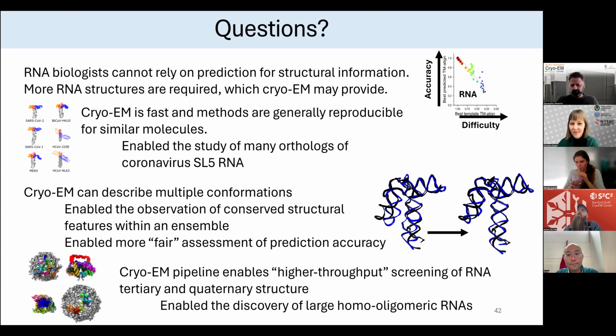Okay. The next question is, at what resolution would you consider a structure as, quote, solved? For instance, for the viral RNAs at 4.5 to 6 angstrom resolution, it's not clear which kind of reactions hold the tertiary structure together with regard to unusual base pairing or hydrogen bonding to phosphate groups, etc. Yeah, I guess this is kind of a philosophy question.